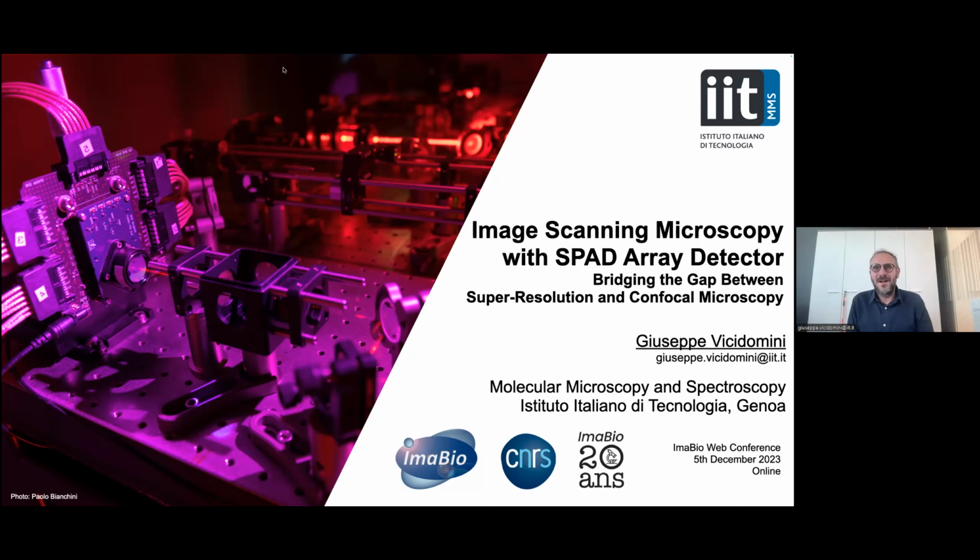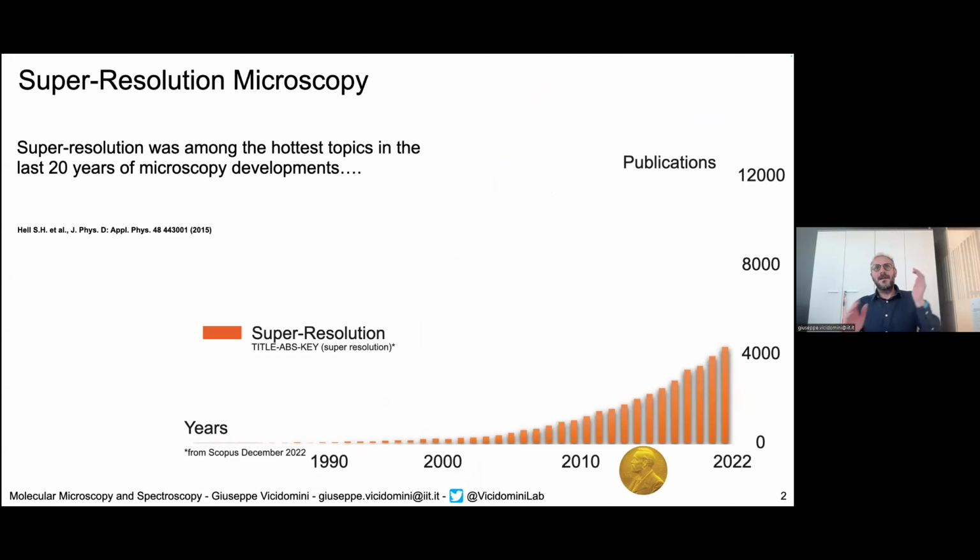Basically today, I want to connect a little bit with the talk that has been given before by Sabrina. Specifically, I want to show you how a novel quantum technology, and specifically a novel single photon detector array, can somehow revolutionize and trigger what, in my opinion, can be the next generation of confocal microscopy. So let me start.